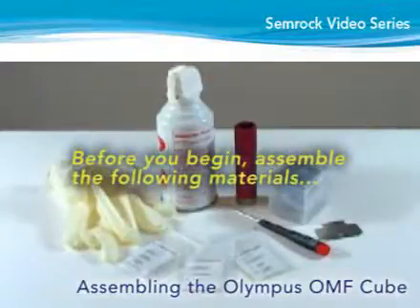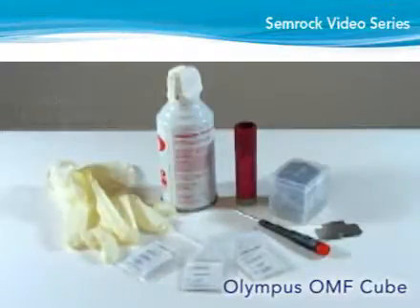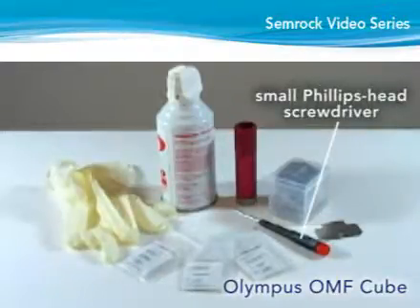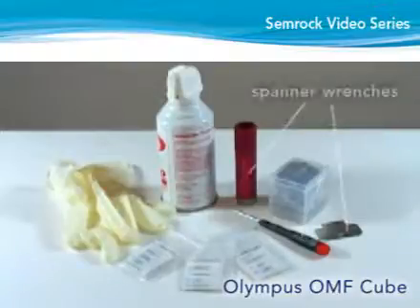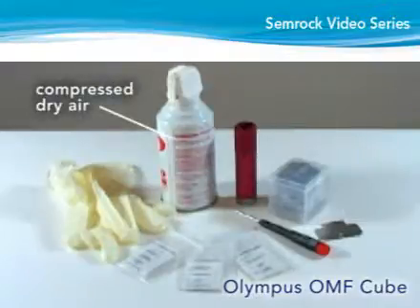Before you begin, gather the following materials: powder-free latex gloves, a Phillips head screwdriver, a spanner wrench for screwing a retaining ring for 25mm diameter optics — such as the flat metal wrench supplied with the Olympus filter cubes — and a bottle of dry compressed air.